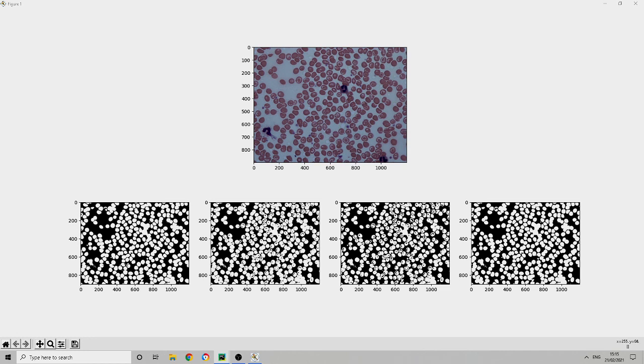So what you can see is that it worked quite well, but we have these horseshoe cells here and here. This is the image Otsu threshold and dilated. So what we did was we expanded each cell in size, and you can see that they're a little bigger compared to these ones. Unfortunately, it didn't resolve our issue with the horseshoe cell here, but I think it solved the issue here on this one. Can you see that there's no black here? So now we have a kind of donut shape, like this one. Now this is the image closed, so it's this image, Otsu thresholded, dilated, and then followed by an erosion. So the nuclei have gone back to their original size, but where the dilation worked to close the object, it remains, and it does here. So it seemed to have worked on some cells, but not all.